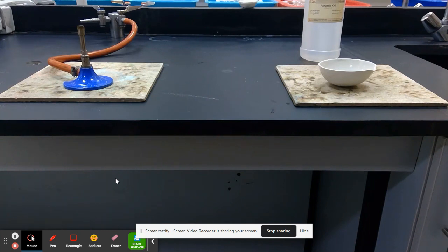At room temperature, methane has already boiled, which means that it must have a boiling point which is lower than room temperature, which at the moment is about 20 degrees Celsius. Whereas paraffin oil is still a liquid at room temperature, therefore its boiling point must be higher than room temperature. So we can see already that the longer chain hydrocarbon, the paraffin oil, has a higher boiling point than methane. So that's the first property we can see: longer chains have higher boiling points.